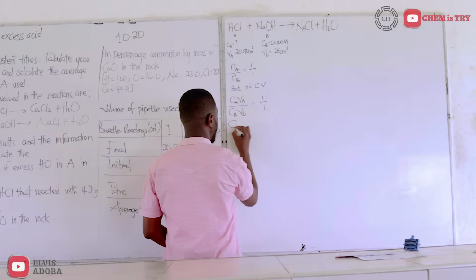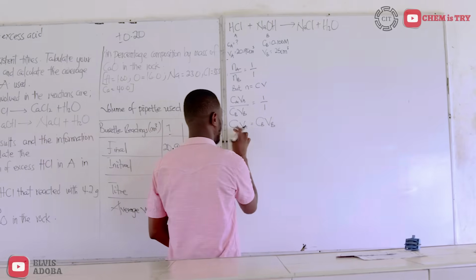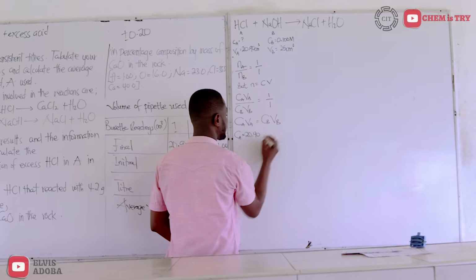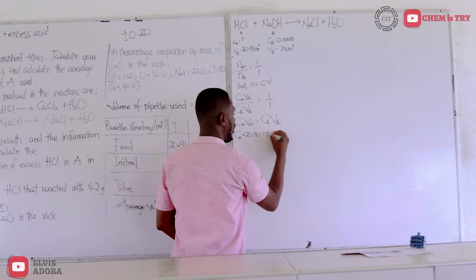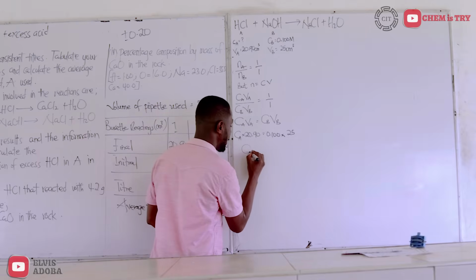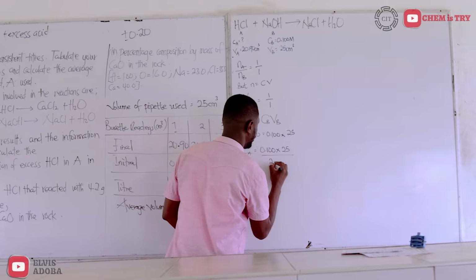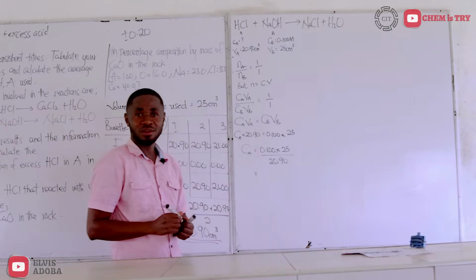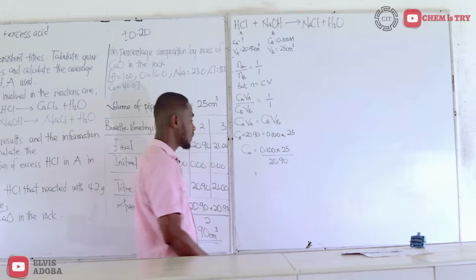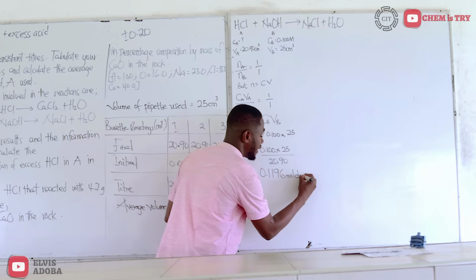When we cross multiply, we have concentration of A times volume of A, giving us concentration of B times volume of B. We don't know this one, CA, but we know VA to be 20.90. CB, 0.100 times VB, 25. So our CA will be giving us 0.100 times 25 divided by 20.90. That will give us the concentration of the excess acid that partook of the titration. 0.1196 mole per decimeter cube.